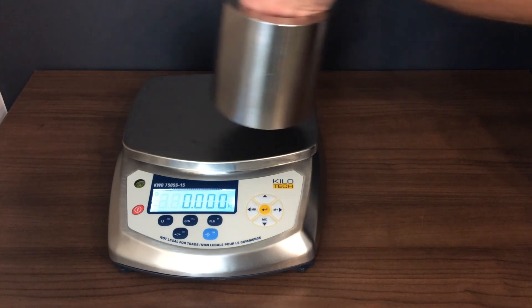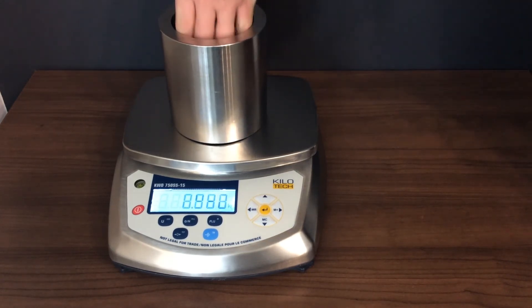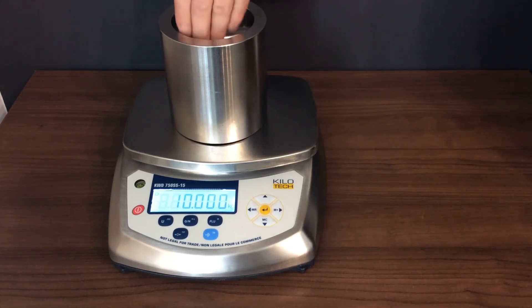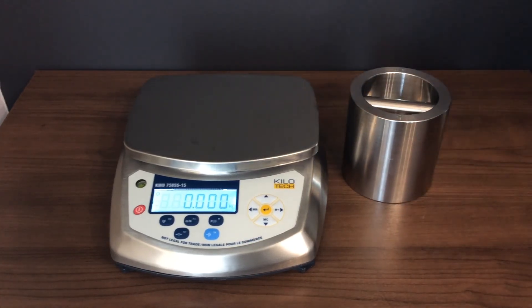When the scale is zero, test the calibration with the weight.